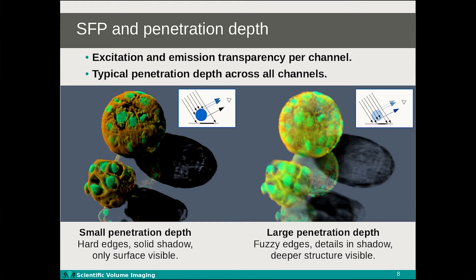One of the most important SFP renderer settings is called the penetration depth. This parameter sets the absorption and emission transparencies for all channels at the same time. With a low penetration depth, the excitation light is absorbed by the object almost immediately and the object appears very solid, also casting a hard shadow. When we increase the penetration depth, the light has a chance to penetrate deeper into the object, revealing internal structures and giving the image an overall softer and more transparent look. The shadow is also softer and reflects the internal structure of the objects.